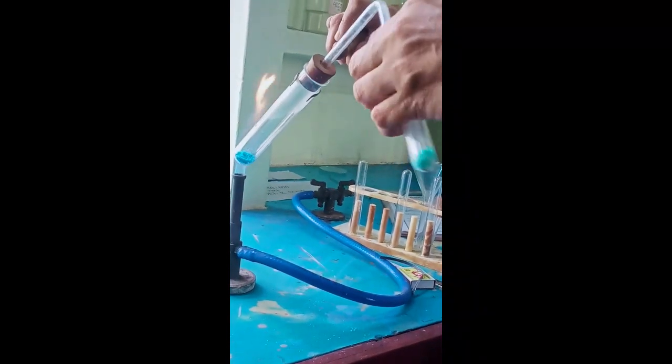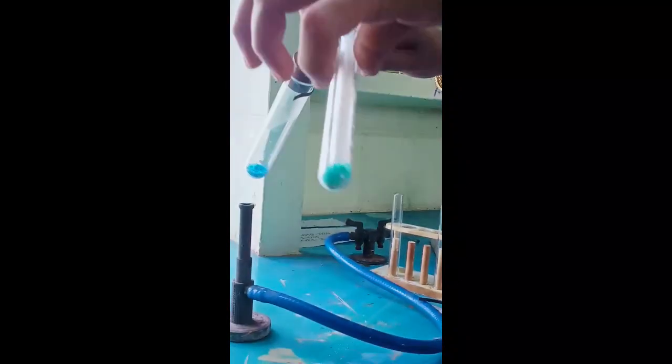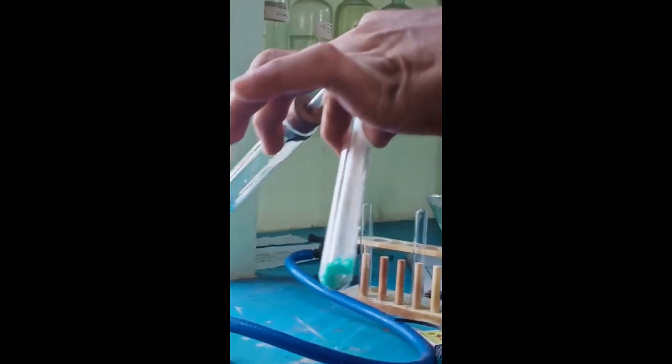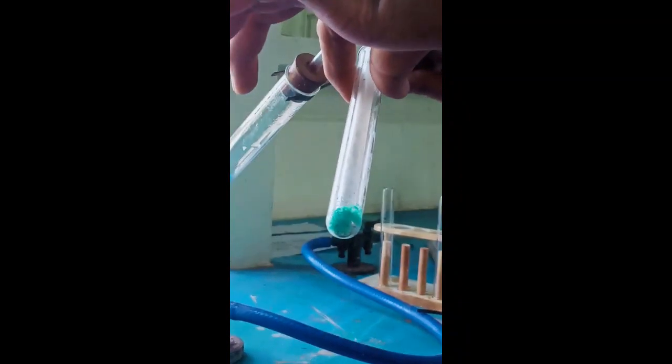On passing water vapor through white anhydrous copper sulfate, gradually this anhydrous copper sulfate turns blue. Here we have white anhydrous copper sulfate. Can you see? Gradually the white anhydrous copper sulfate turns blue. So the test for water vapor is that it turns white anhydrous copper sulfate from white to blue.